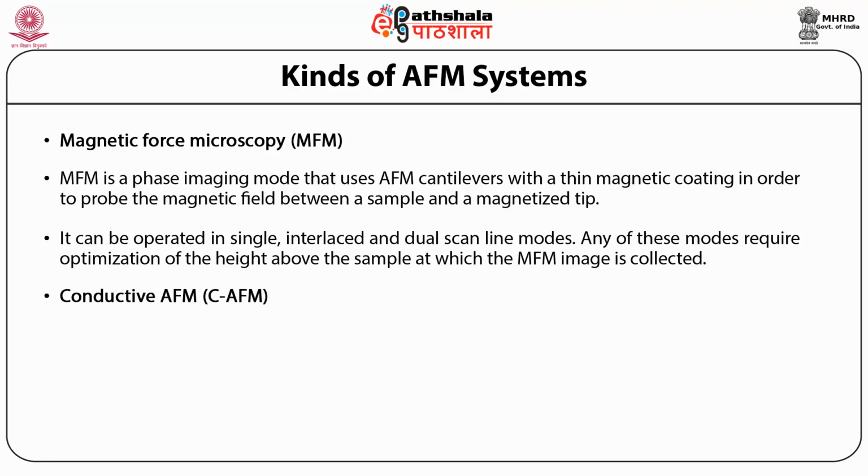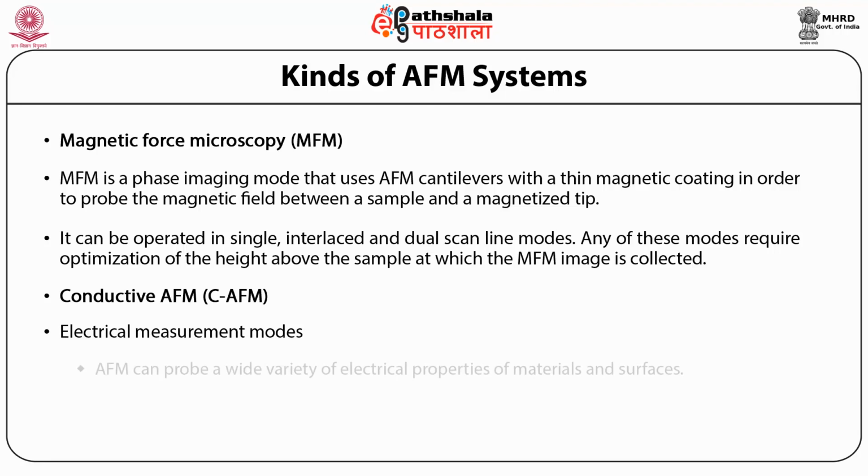Now, the conductive AFM, or generally termed as CAFM. In this mode, electrical measurements are performed. The AFM can probe a wide variety of electrical properties of materials and surfaces. These methods operate either in static mode or dynamic mode, depending on the information being sought.